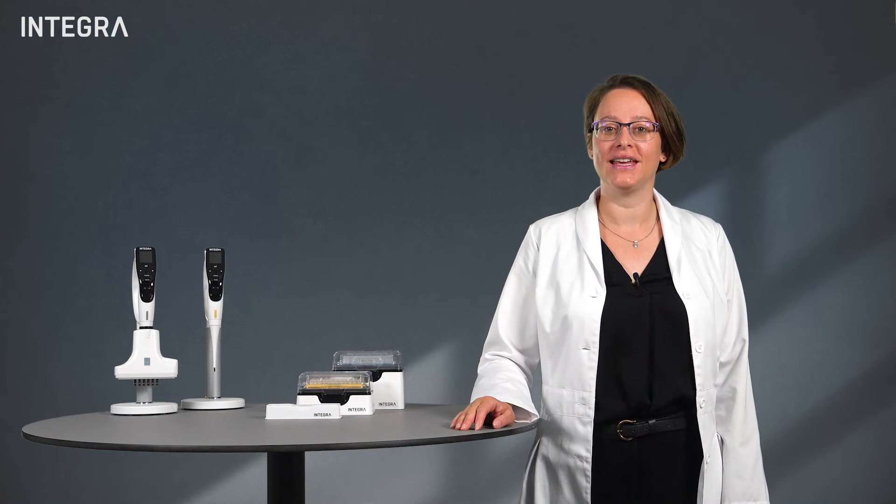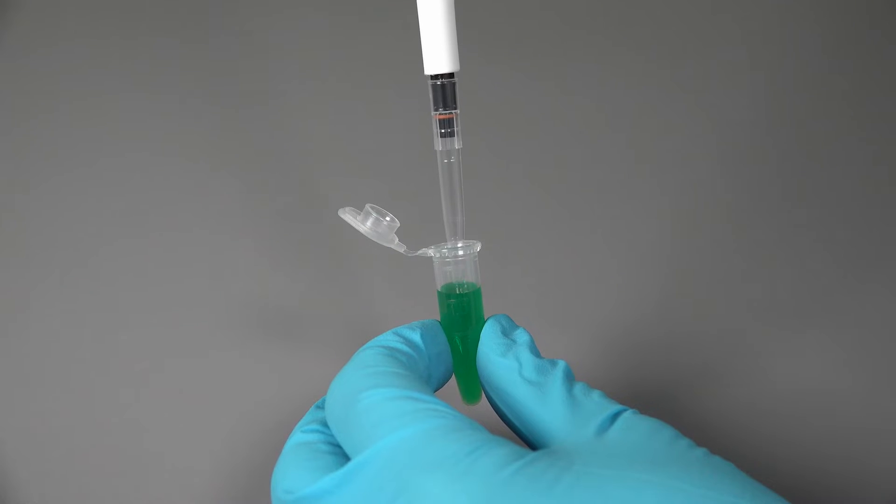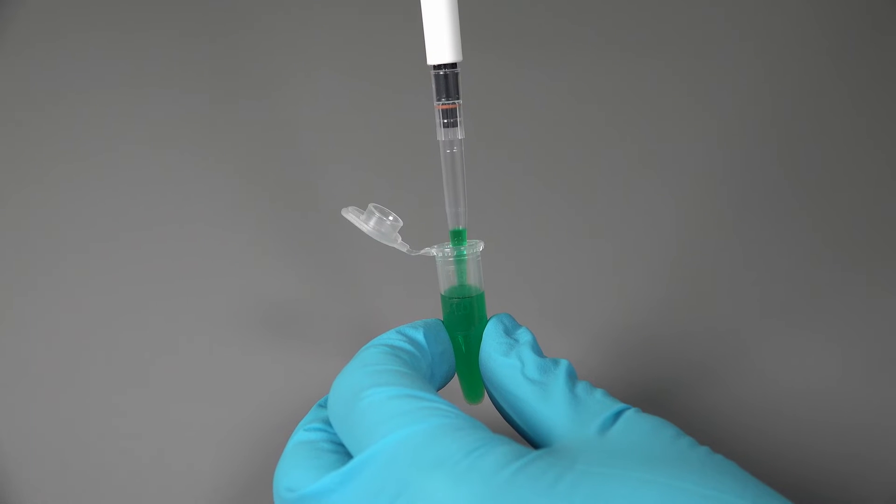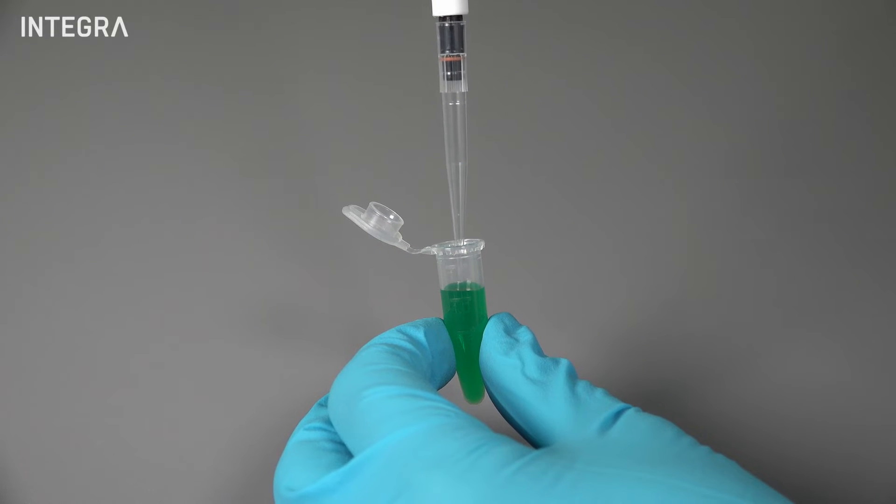When working with volatile liquids, it's generally considered good practice to pre-wet the tip before beginning. Using the liquid you'll be pipetting, aspirate and dispense the full volume of the tip three times to help equilibrate the air pressure and humidity inside the tip.